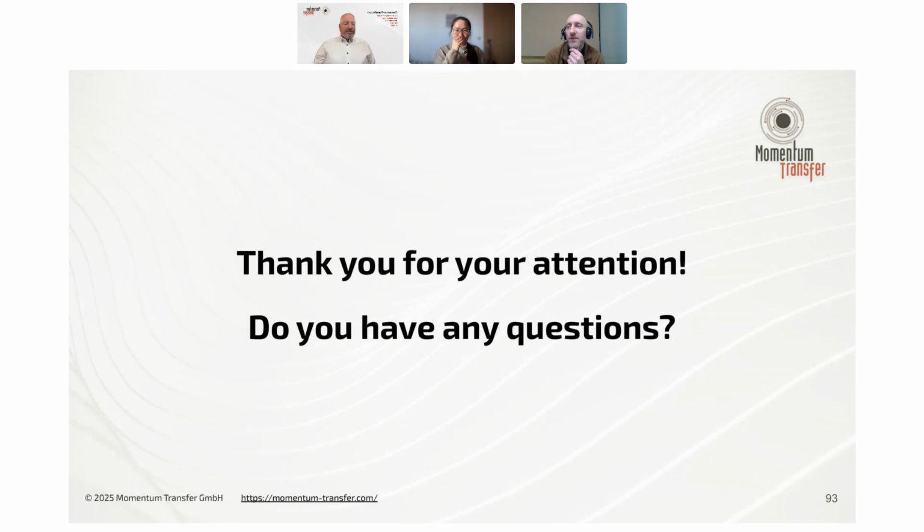But for a similar setup, if you wanted to do a time dependent measurement, it depends on the type of materials that you're looking at and how well they scatter. But there are some setups that can go sub-second resolution in terms of what you can track. And if people are interested in that, you can certainly contact me. We've done a lot of work in nucleation of metal organic frameworks and transformations happening at temperature. And in those cases, you can really see structural progressions of these nano phases and stuff like that. It's a really powerful technique.